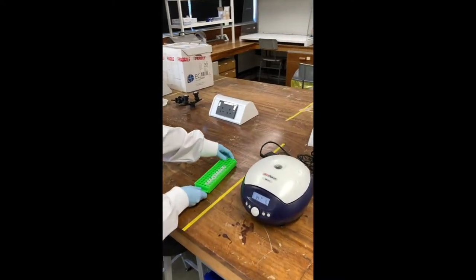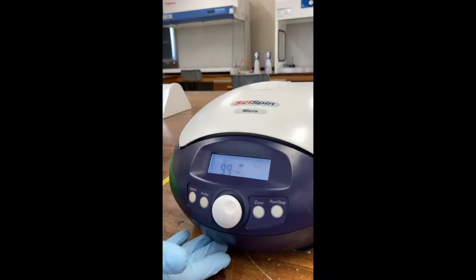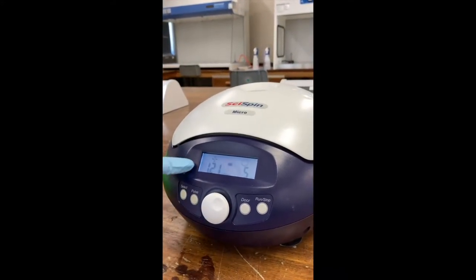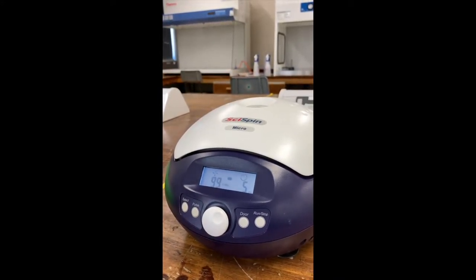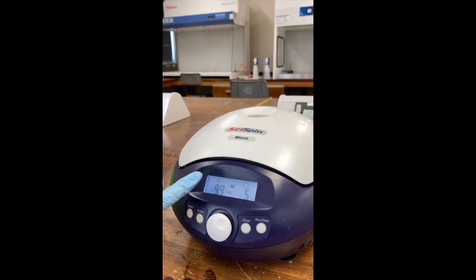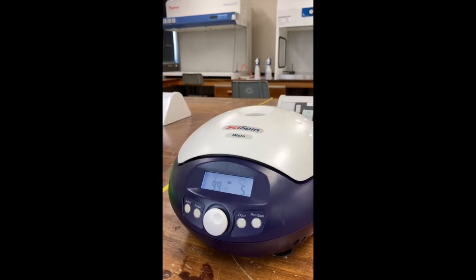And the next thing you need to do is adjust the settings on the centrifuge. So the first thing you'll do is press select and you can alter the revolutions. That will be the number of times the centrifuge will spin. This will either be in revs or in G, it's important to know which one of those you're adjusting and what setting you need.